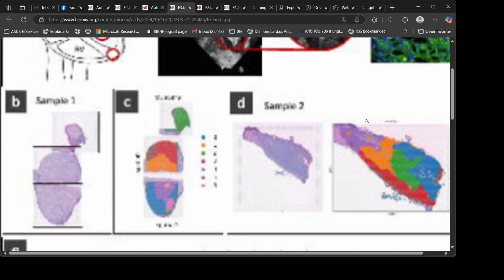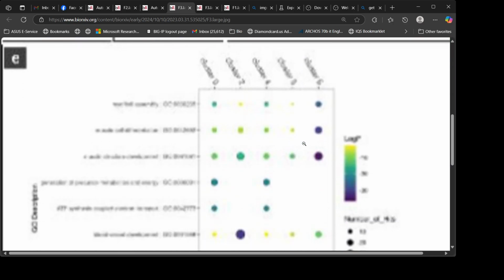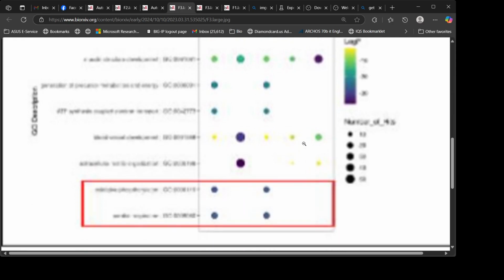C, example of STAGATE clusters visualized across the reconstructed coplanar dataset, labeled as Sample 1 in panel A, within VR-Omics. D, example of STAGATE clusters visualized across the single-section dataset, labeled as Sample 2 in Panel A, within VR-Omics. E, GO analysis results of the multi-slice coplanar dataset using the STAGATE cluster markers as inputs for Metascape.